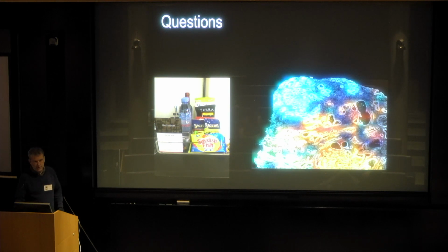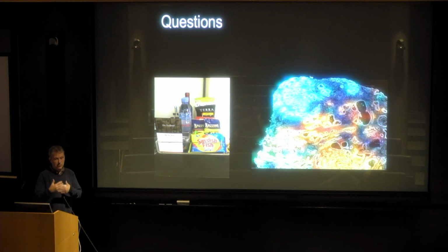That's a super good question. So H&E staining works just fine. Certain antibodies that work very efficiently, where you have a short incubation time, will work. The majority of antibodies need an overnight incubation or something like that. Then the RNA will be degraded. But I think, without pushing this too much, you will find ways to actually combine these measurements much better. So for instance, we have used, from the CITE-seq kind of antibodies, which also have a barcode. We combine those on our arrays, and that looks pretty good, actually.